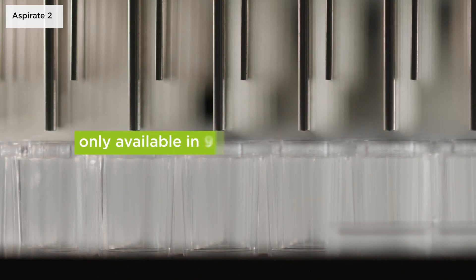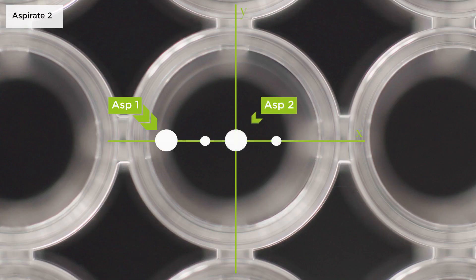Crosswise aspiration is only available in 96 well flat bottom plates where a second aspiration position can be defined, typically close to the centre of the well to reduce the residual volume.